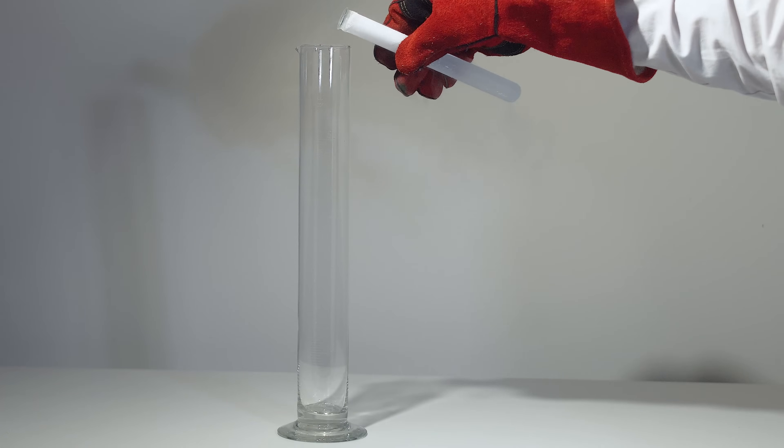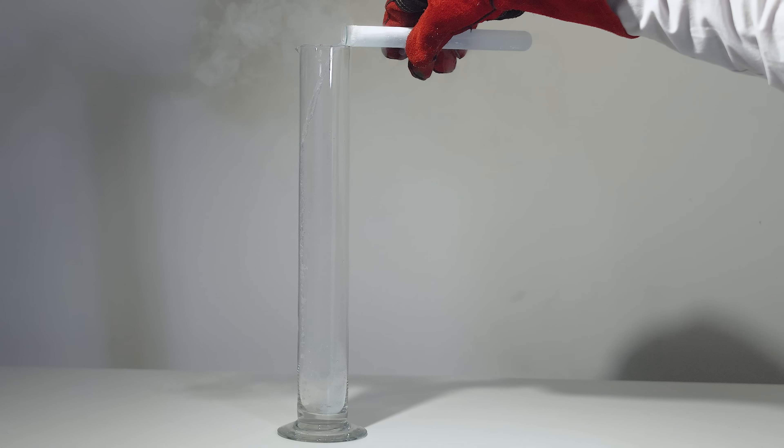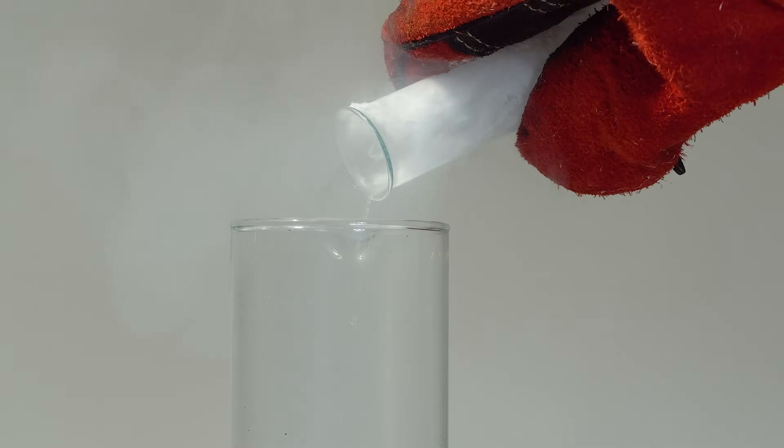Now I'll create an atmosphere of pure oxygen in this glass cylinder by pouring liquid oxygen into it. After which, as you guessed, I'll try to add the rubidium-cesium alloy there.